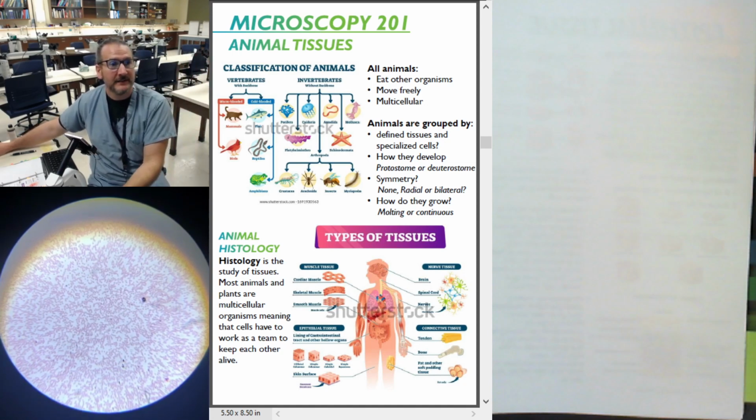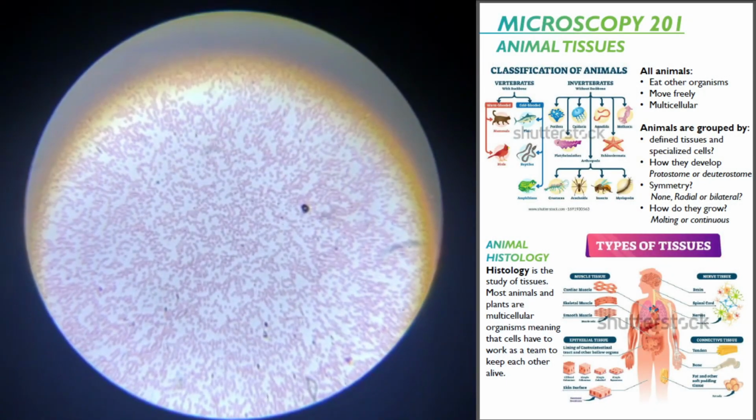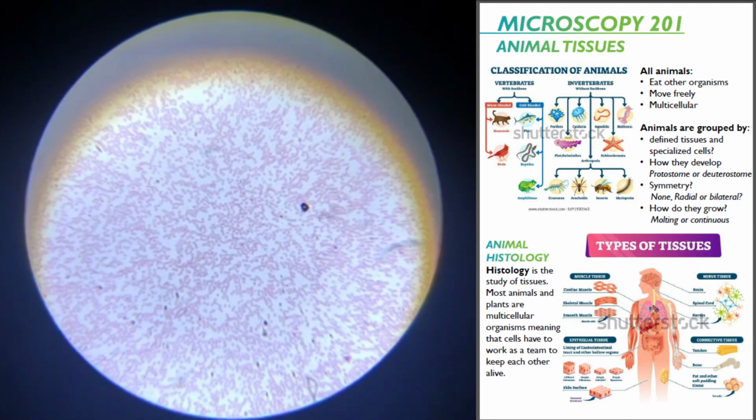So we're bringing this in. Looks really good. I'm going to blow this up a little bit. Nice. And I can see some little purple cells. I'm really interested in seeing some of the purple. So you're going to have millions and millions of these little red ones, but the purple ones, I'm not sure yet. I'm thinking that's a flaw. Looks like a purple one there, some other little purple ones.